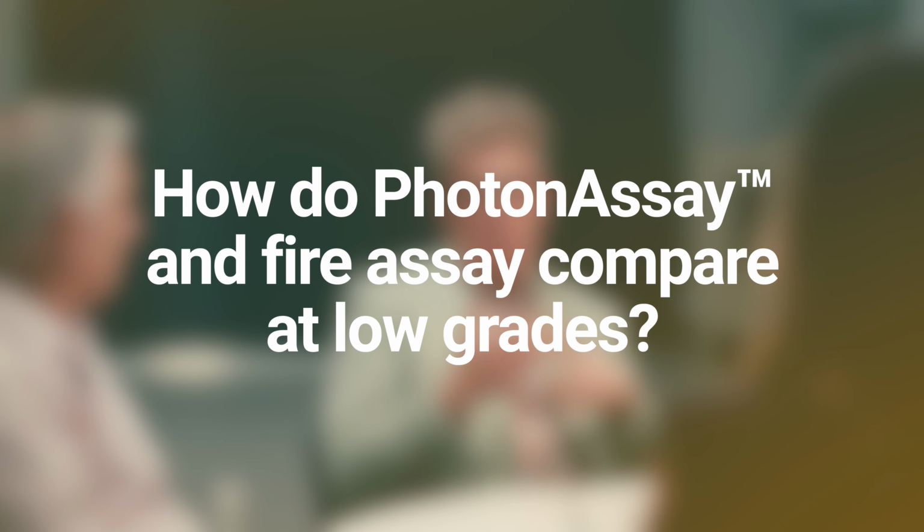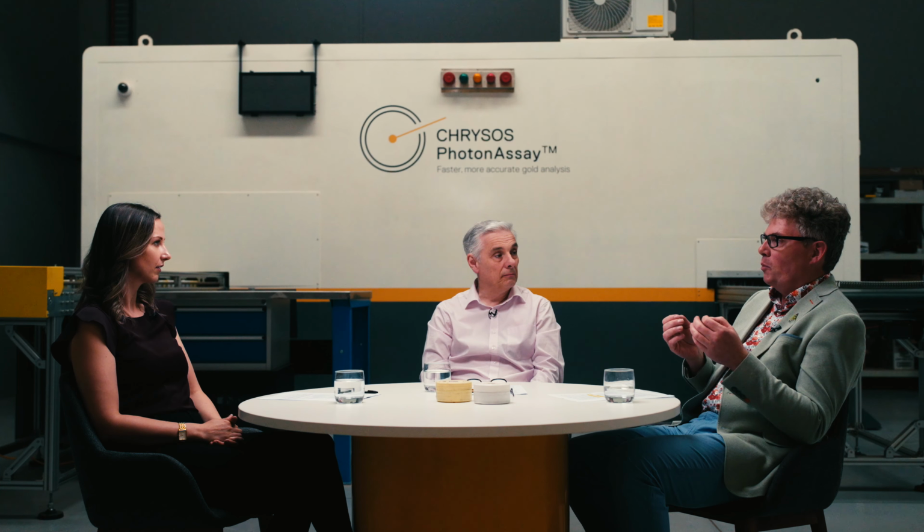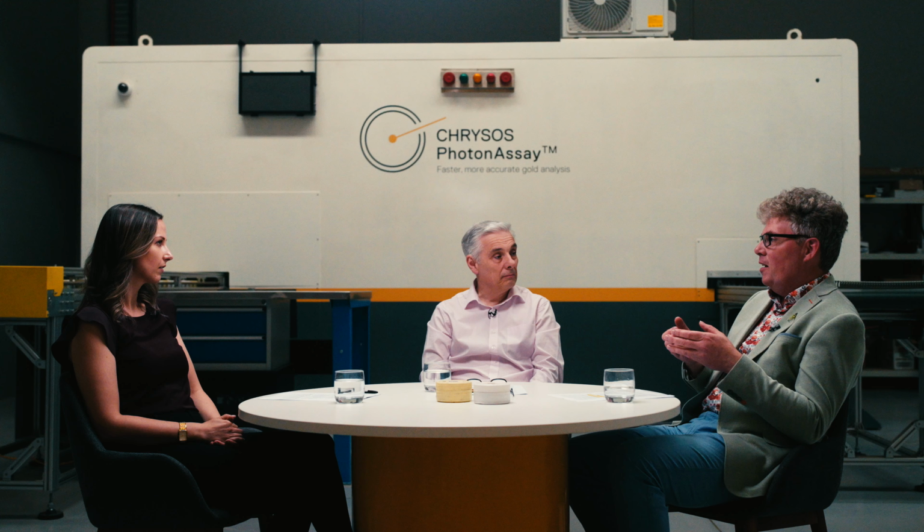That's a really good point, because one thing that's very easy to do is to just look at straight instrument performance. So you run your standard CRMs at 0.3, 0.2, 0.1 ppm, you get a pretty direct measure of instrument performance. And at 0.3 ppm, PhotonAssay performance at instrument level is a little bit worse than fire assay. As you go down to lower grades, that gap widens out, and that just reflects the rather different detection limits of the two methods. But your point, Naomi, of including the sampling uncertainty in there is key.